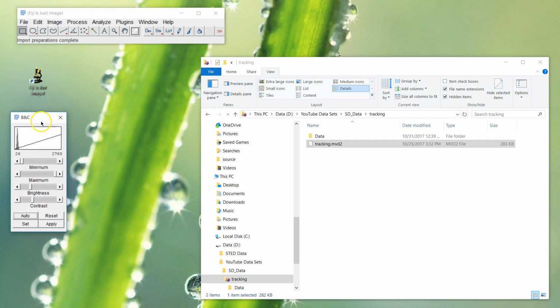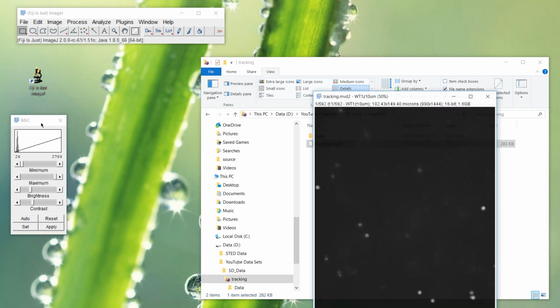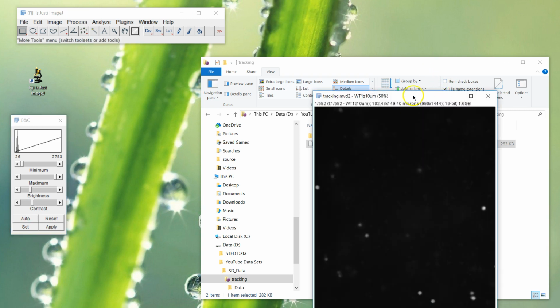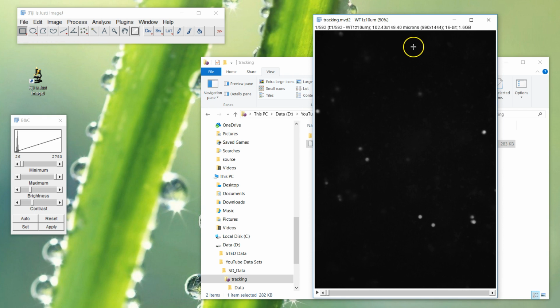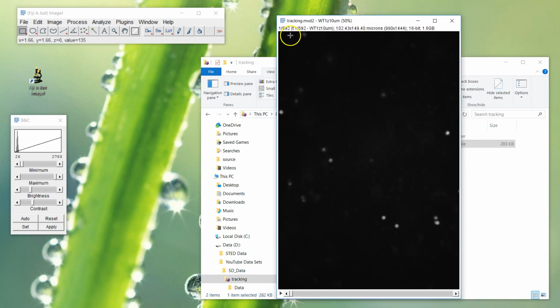So that'll take a second, and what we're going to do is export the files to individual TIFFs and to one big TIFF that's a series of TIFF in one file for different analysis software depending on what you need to do. These are 16-bit data sets, so when you open them up with Windows as TIFFs, it won't show them. So we've got some YouTubes on 8-bit versus 16-bit and picture versus data, so have a look at those.